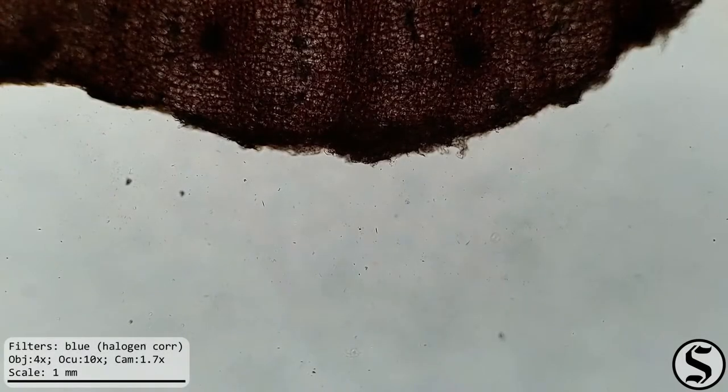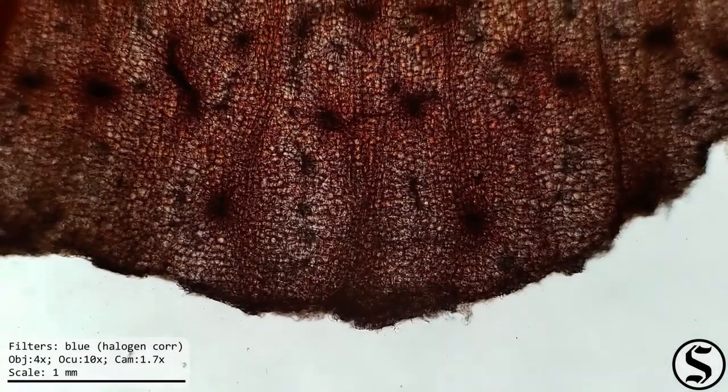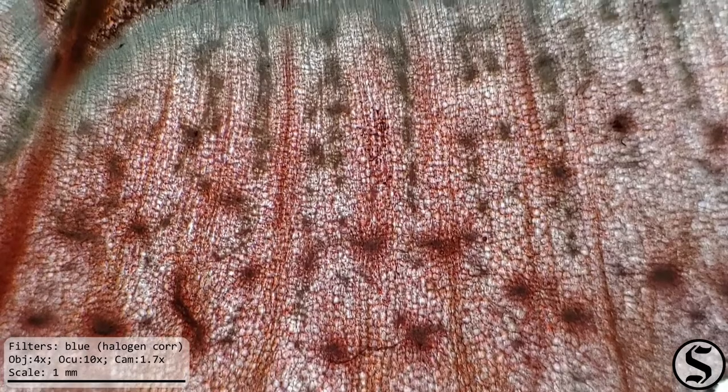Looking now under the microscope, it should be apparent why we needed a thin slice. This is a compound microscope, which means that our samples need to be thin enough for light to be able to pass through them, and it looks like indeed we were successful in that regard.